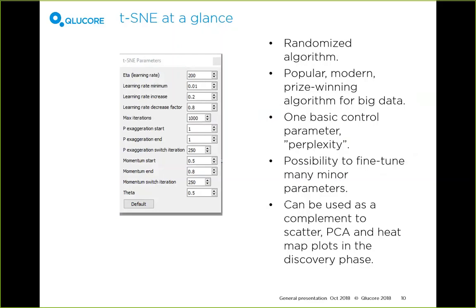Although you have one basic control parameter, there are plenty of fine-tuning parameters available. They are described in the academic literature regarding t-SNE, and if you want to change the fine-tuning parameters, that's possible to do in the software.